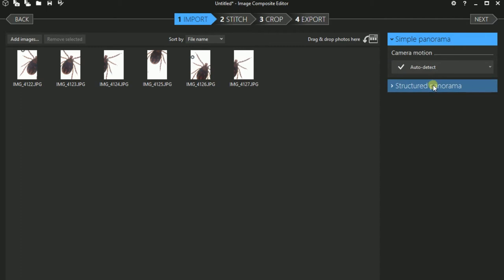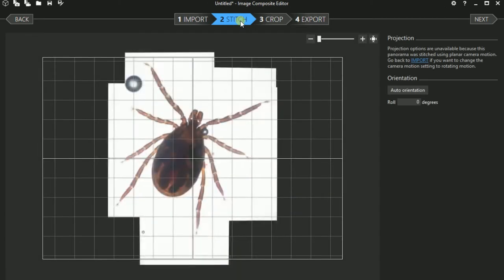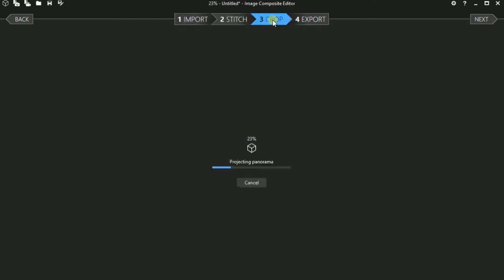You can set it to auto detect and then it will auto detect the format. You click on the stitch button and it will align the images and compose the images. And after a few seconds you already have the stitched picture. That is basically a very fast and quick method to do that.